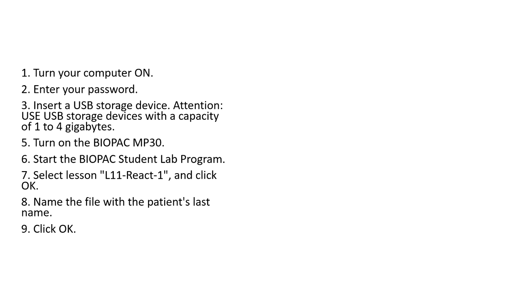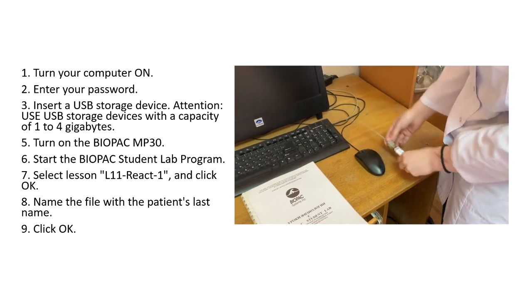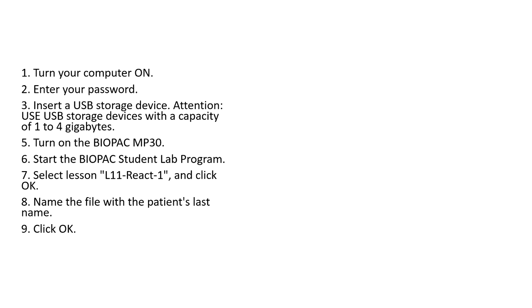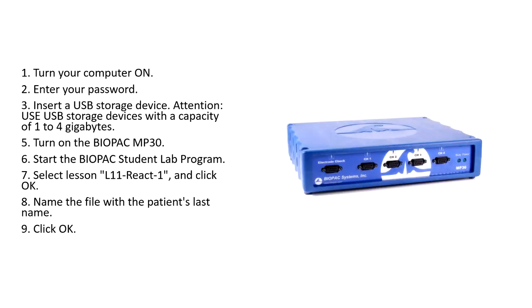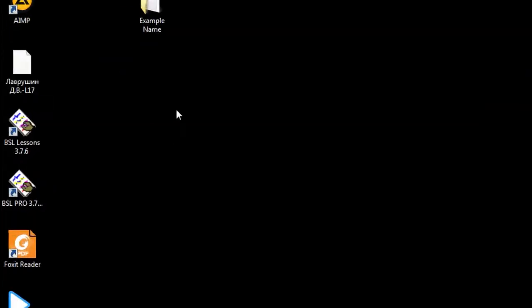Setup: 1. Turn your computer on. 2. Enter your password. 3. Insert a USB storage device. Attention! Use USB storage devices with a capacity of 1 to 4 GB. 5. Turn on the BIOPAC MP. 6. Start the BIOPAC Student Lab program.